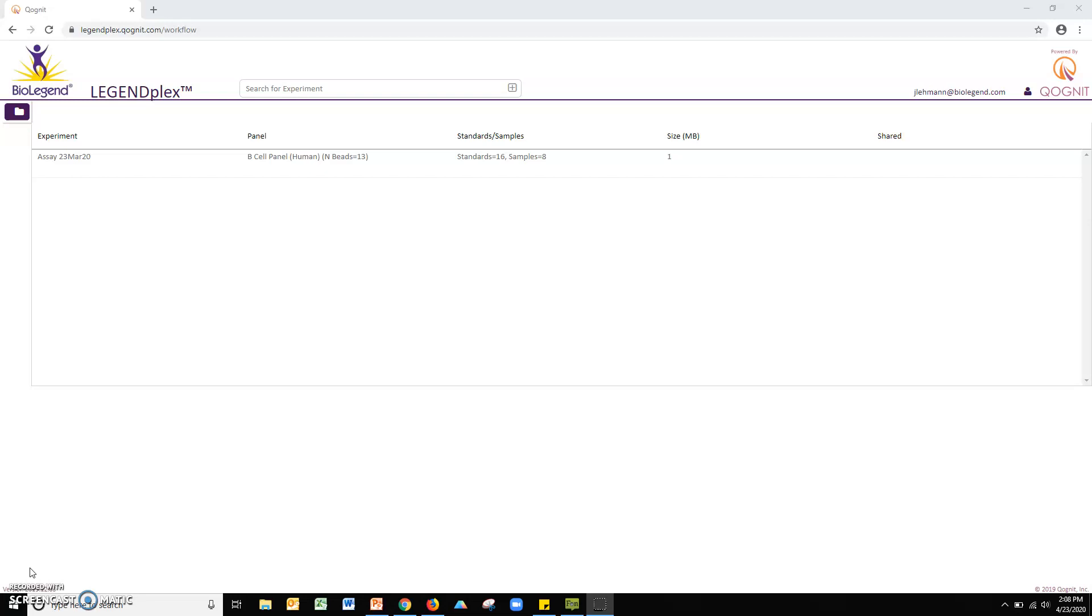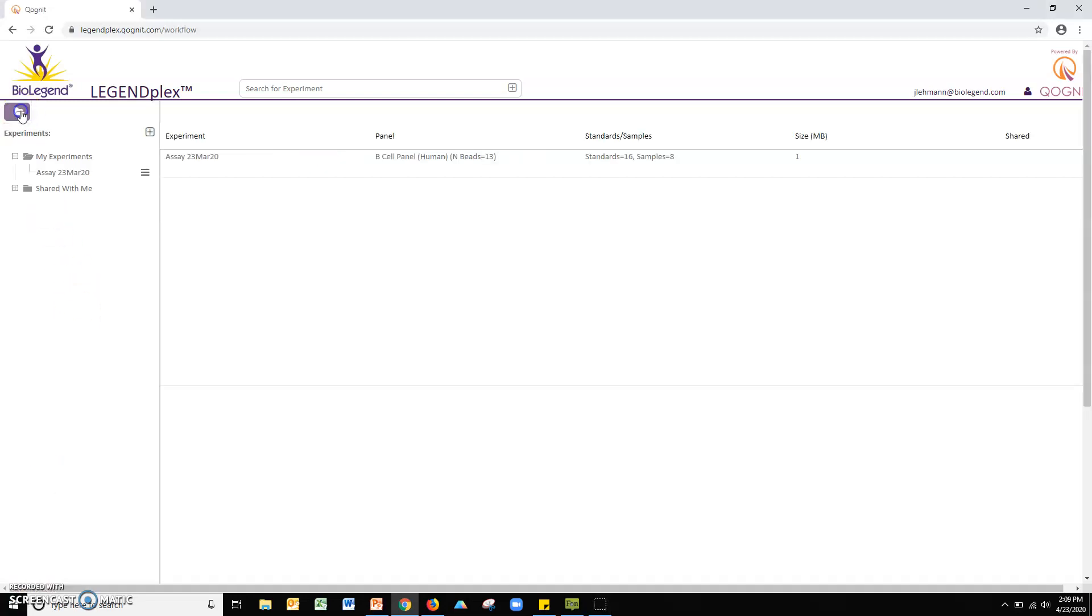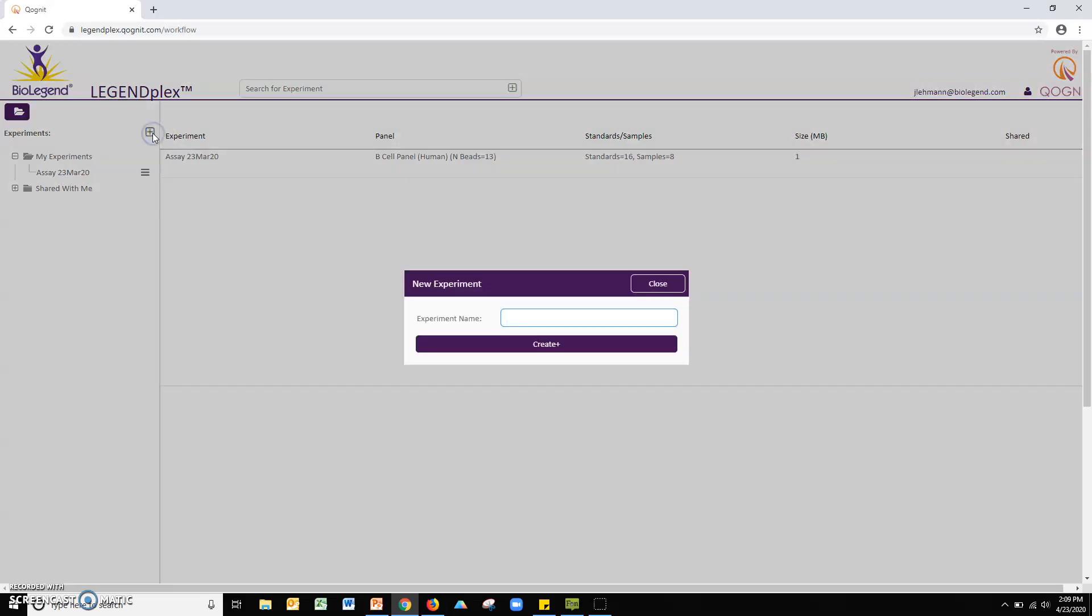Click the purple folder icon to the left of your screen. Next, click the plus icon. Enter your experiment name and click the create button.